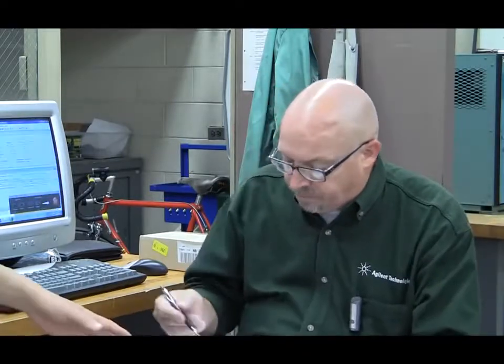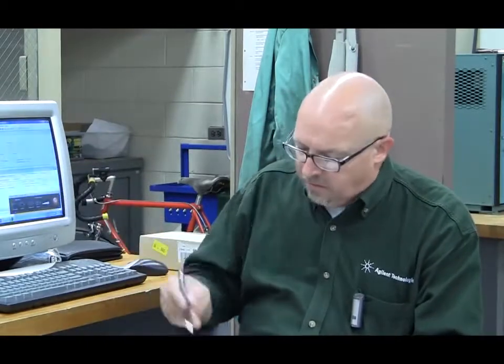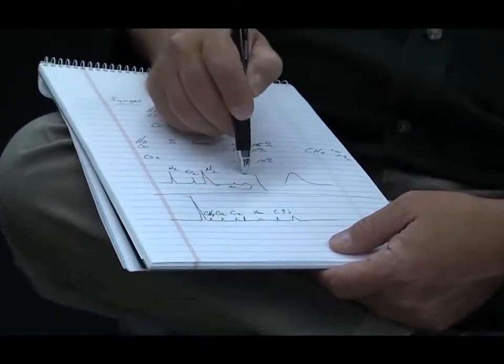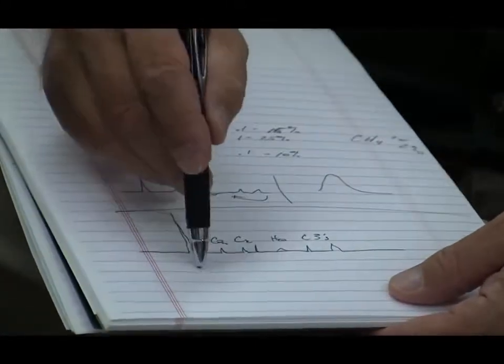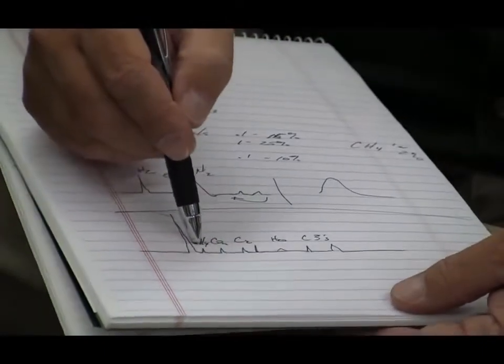that off. This is super important for us to understand. Yeah, I mean, it'll be named and they'll be done by retention time, but this should always hold true, because the retention time is going to be set by whatever we set the pressure to be on the column. So we're going to see helium, hydrogen, oxygen, nitrogen, then methane and CO. On this other one, we're going to see an air peak, or a composite peak, that we won't analyze.